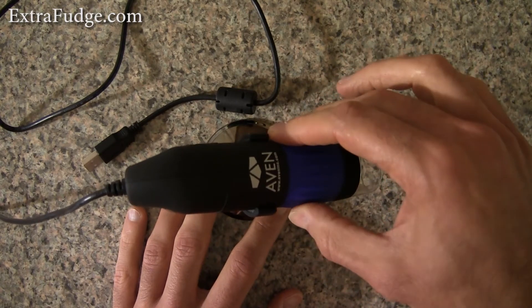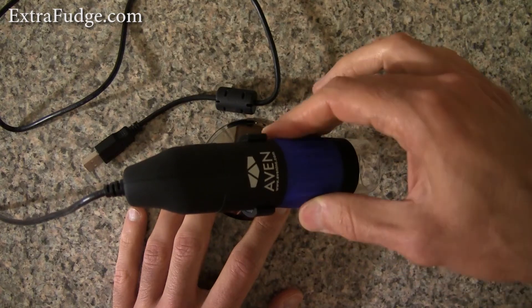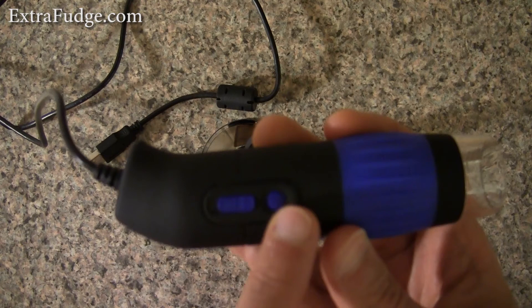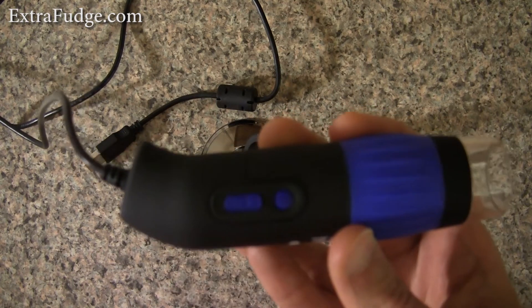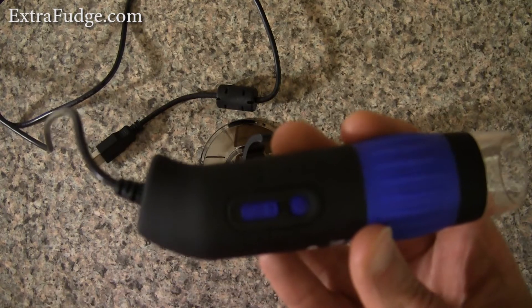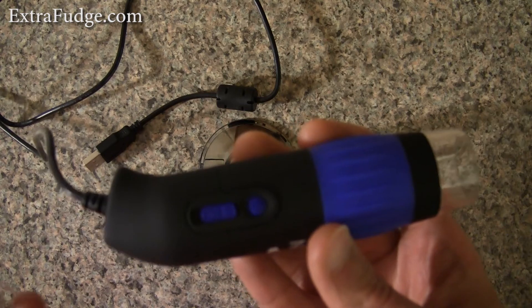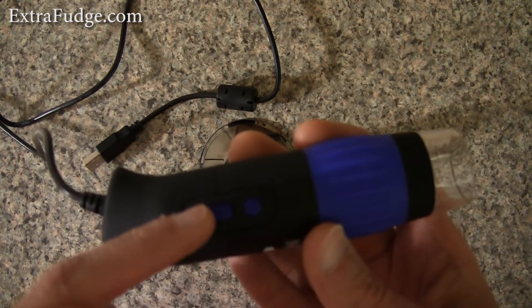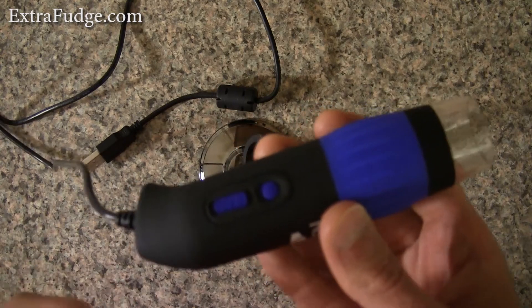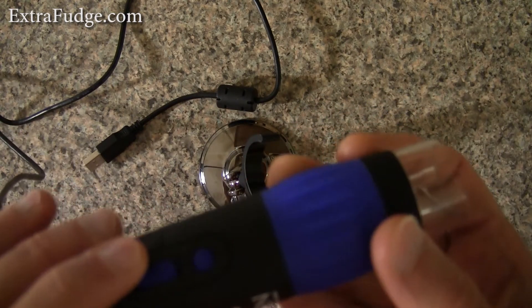There's pretty much no way to not move this thing while rotating the ring. Another thing I didn't like was these buttons right here — I found them to be unnecessary. I would have preferred all these controls be software-based, because when you press something or move the switch, the entire thing moves, which kind of defeats the purpose of keeping everything fixed.